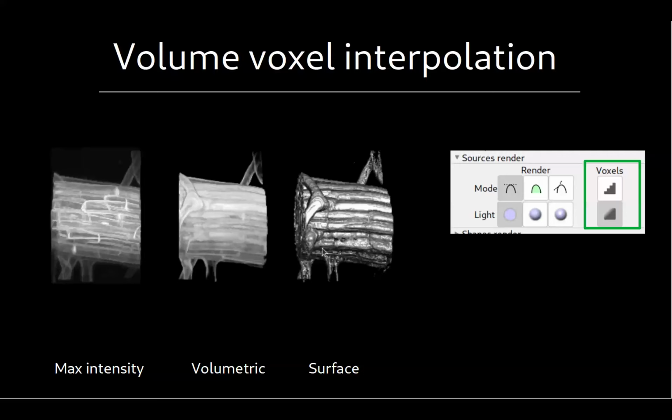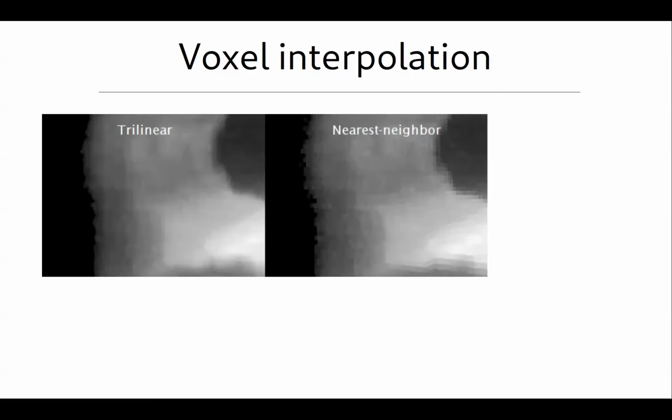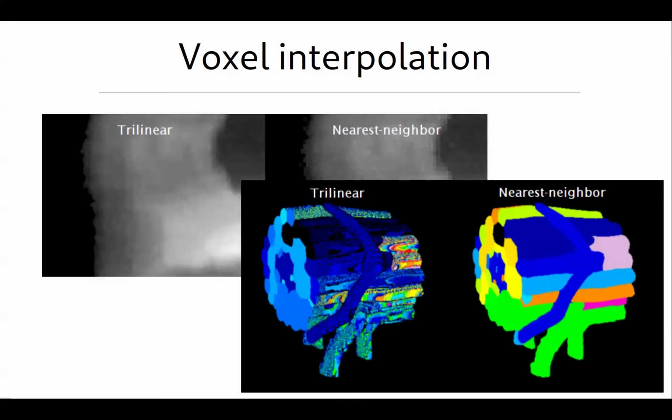By default, trilinear interpolation makes data smooth, and nearest neighbor is more like each voxel really looks like a voxel. So in principle, if you work with continuous microscopy data, a continuous distribution of intensity, trilinear is the best. And nearest neighbor is always going to look voxelated, unless you're working with some kind of segmentations. And in segmentations, you actually don't want to do any interpolation.